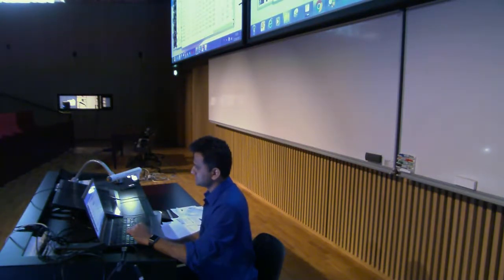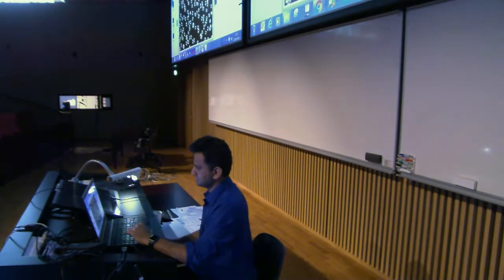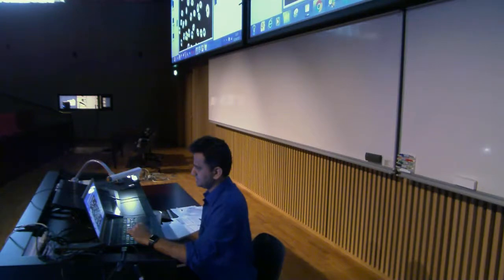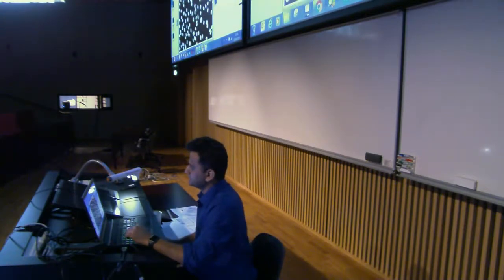So just close this. Again, close everything, close this. And then how to get rid of this? Just go here, edit, selection, and select none. Overlay. Manager. Okay. That's off now.